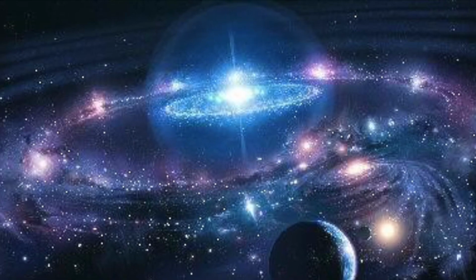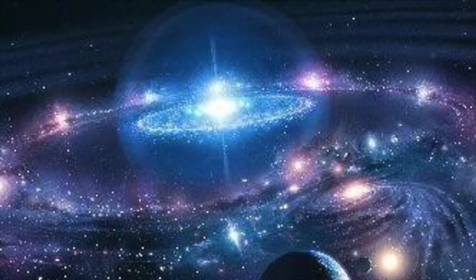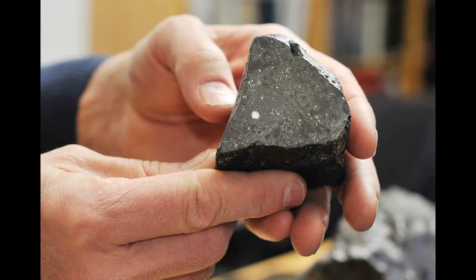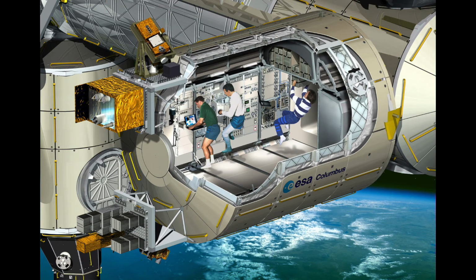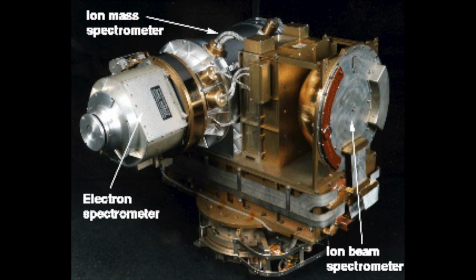It can also be used for exploring things in the universe. Two primary applications for the mass spectrometer in space are A. Analyzing the composition of the planetary atmosphere, and B. Monitoring the air quality of the manned space flights. The Cassini spacecraft contains the Cassini plasma spectrometer, which is used to measure the composition of ionized molecules originating from Saturn's ionosphere and its moon Titan.